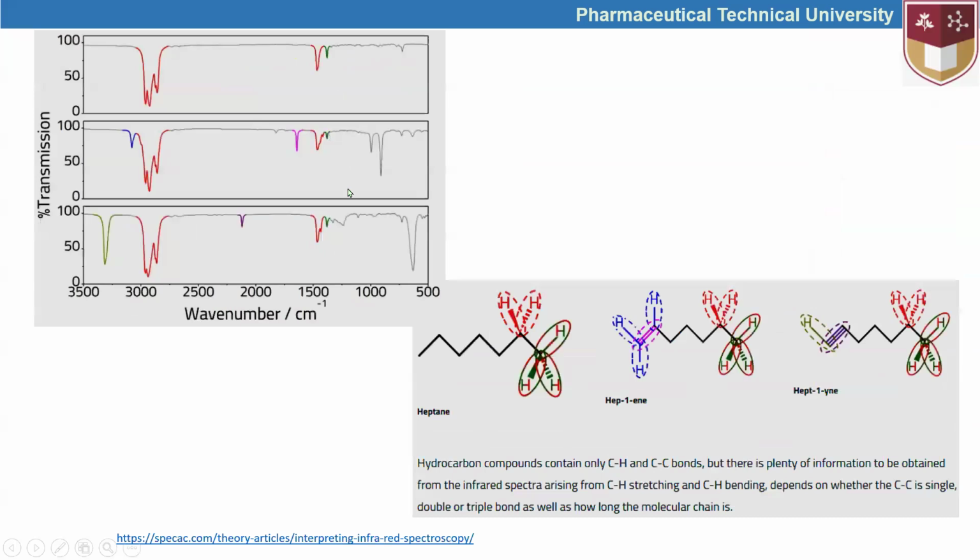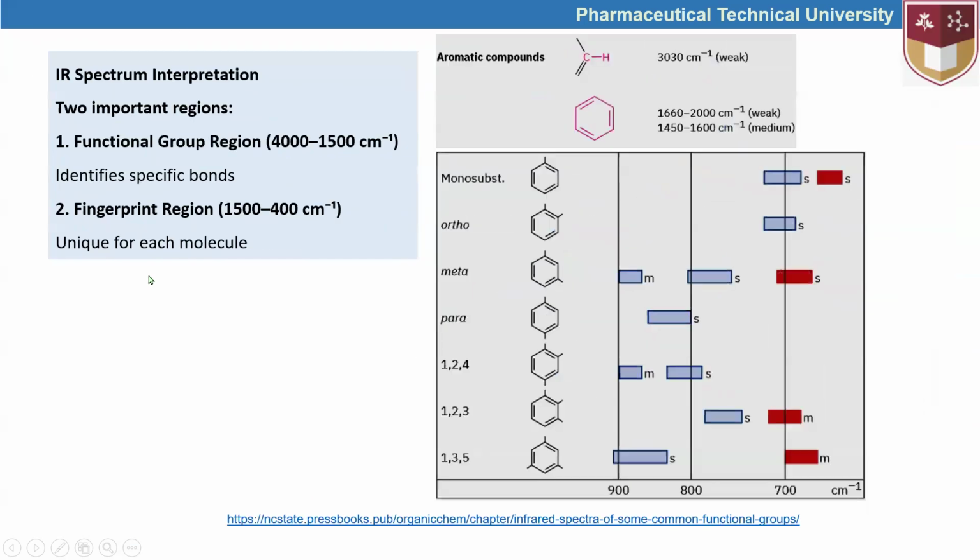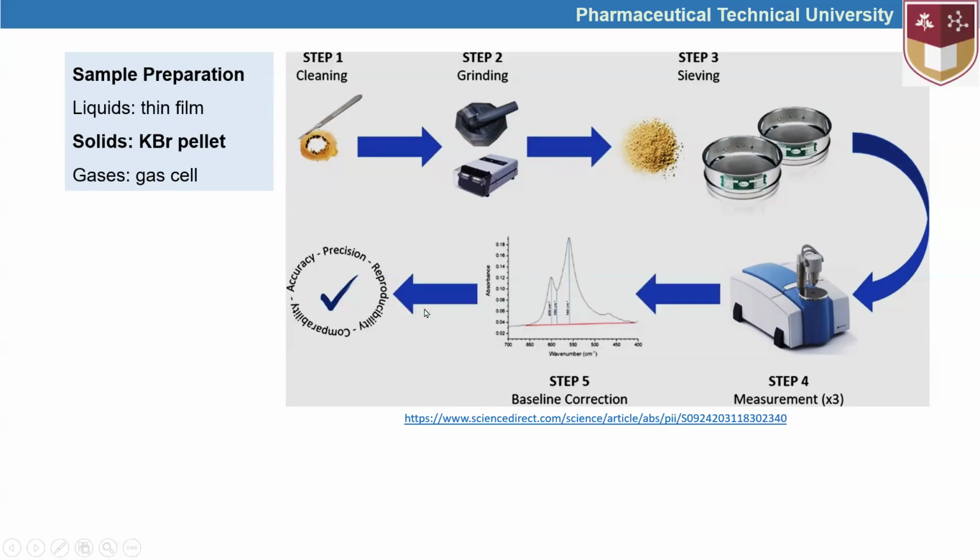Let me show you one example. Here these are about the transmission. So 100 belongs to transmission, and this belongs to the absorbance, and the higher absorbance is linked with the lower transmission level. And in this case, here we can see this is about the absorbance. Yeah, high absorbance is the one that could be something like this if we see the transmittance level.